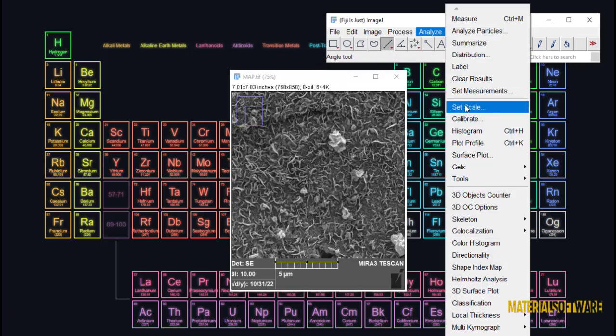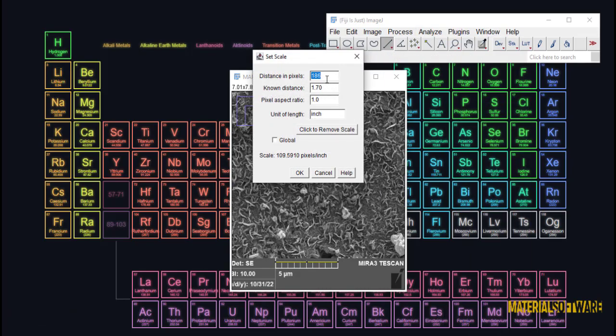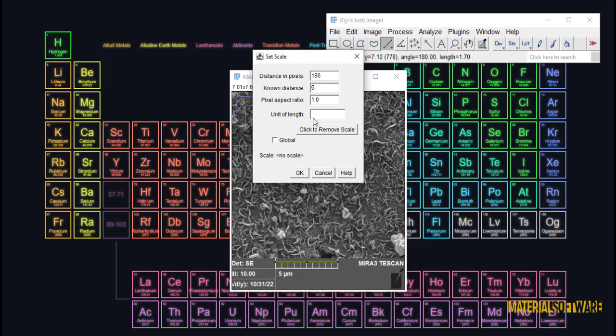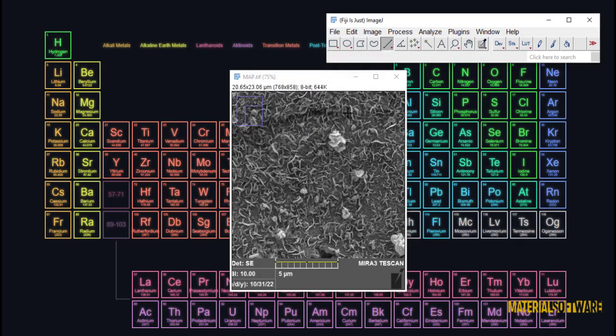First we enter the SEM image into the software. Always remember that for most tasks we want to do with ImageJ software, there is scaling and calibrating the image, which we taught in the first part.